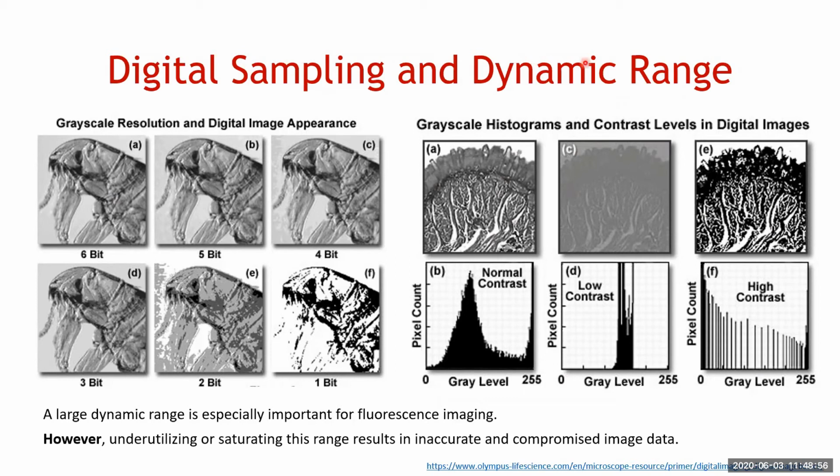or the dynamic range that the digitizer gives you. So when we train people up, we always make sure to bring up the histogram. Why is that? It's because it's a very quick visual representation of the distribution of intensities in your image. Now, a lot of microscopes nowadays, at least the software, like to play different tricks to make sure that your image looks really nice on screen. Anything can be made to look good, but the histogram will never lie.